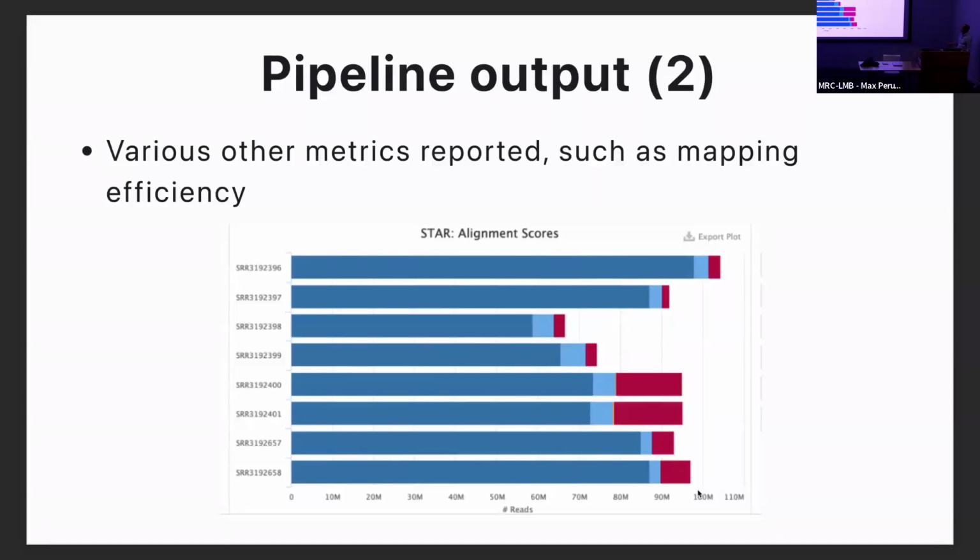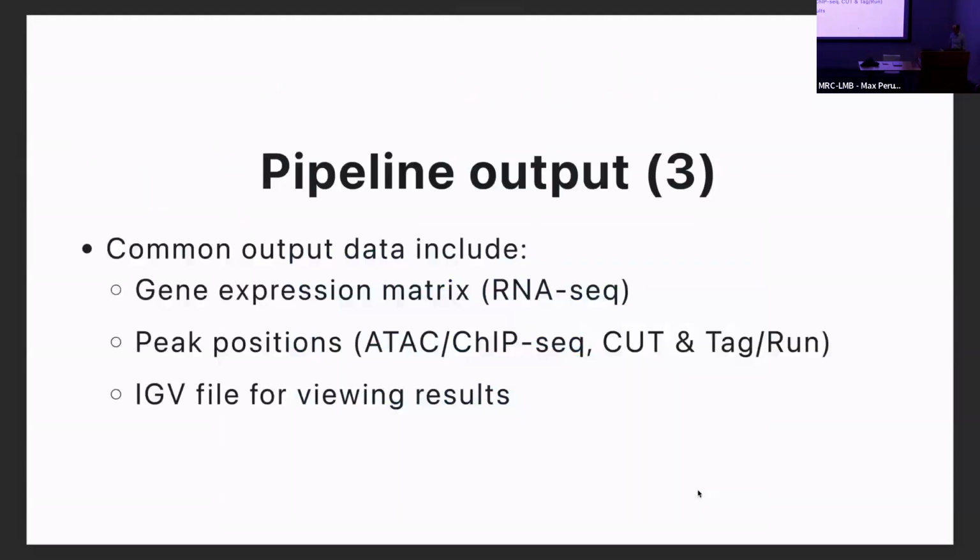And you can see in blue the number of reads that mapped and in red, the number of reads that didn't map. And this is quite good because most of the reads do actually align to your reference genome. If they were all red, don't go ahead and start analyzing the expression matrix, because it's probably just artifacts and rubbish. So definitely do check this whenever you're doing anything.